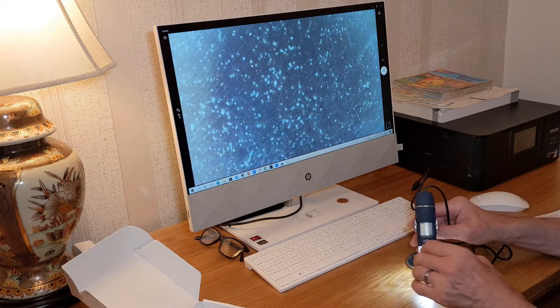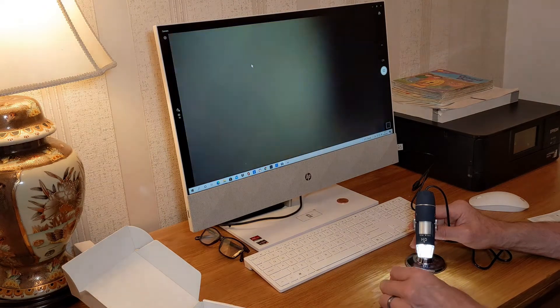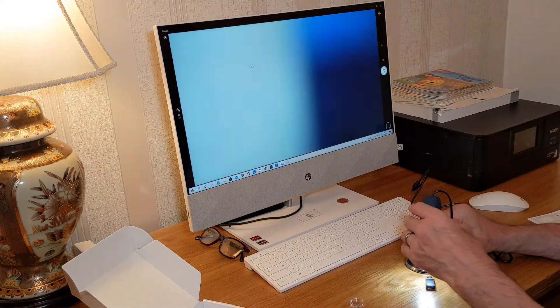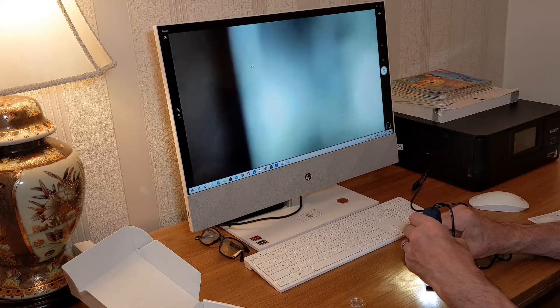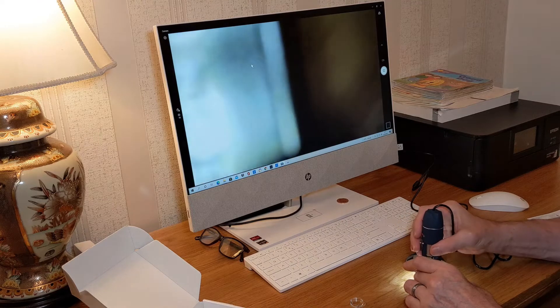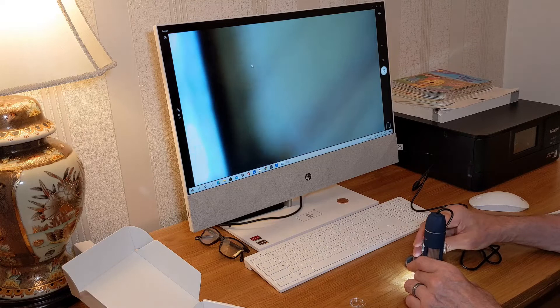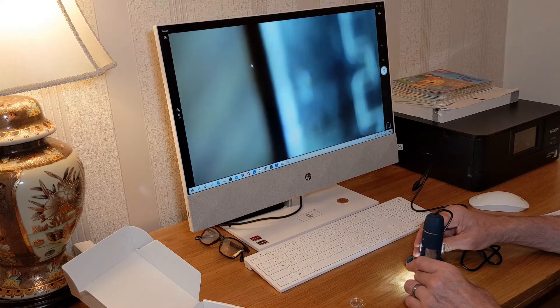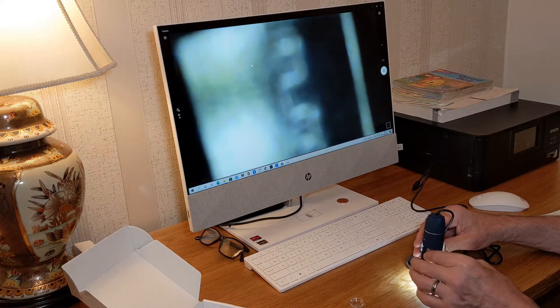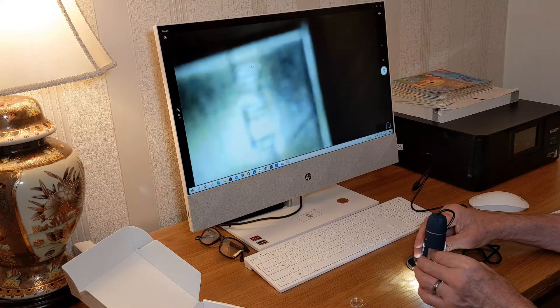Oh, I need to take off the lens cap! I thought, what's going on here? It ain't that cool - what am I on about! There you go, that's better. So obviously you can see my deliberate mistake there - make sure you take the lens cap off. You just use this dial to focus it in.